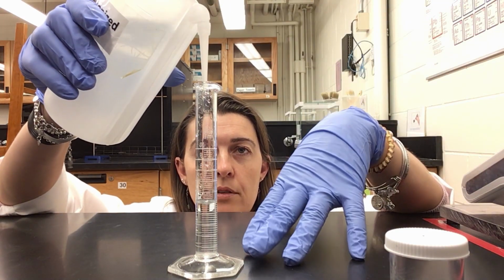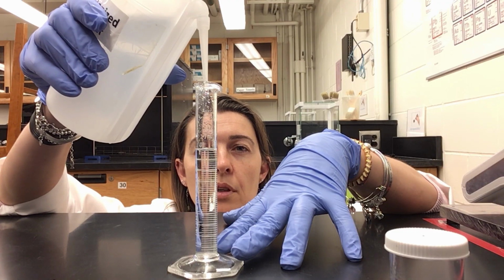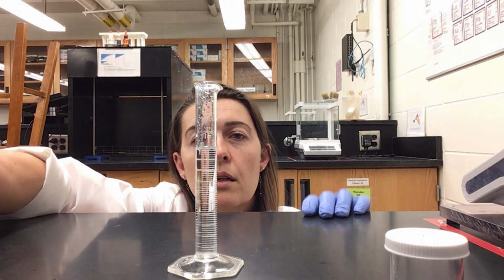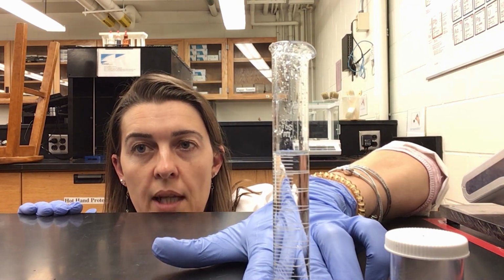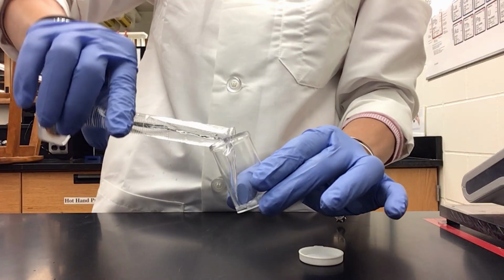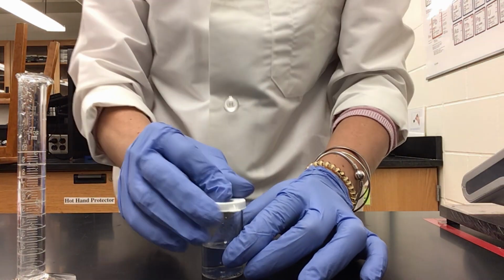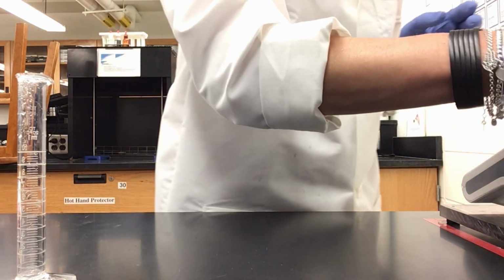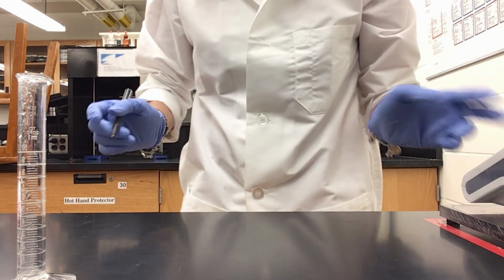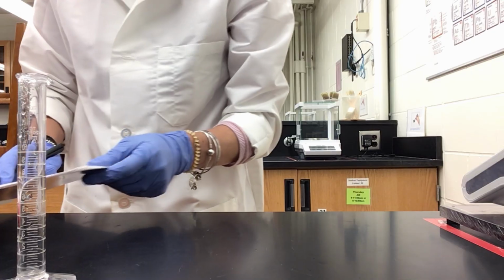So I can go a little faster now. And I need to make sure that the meniscus is right at 10. Oops. Okay, so can you see this? The meniscus is right at 10. So now I am gonna take my dried vial and transfer everything inside it, shake it really well, cap the vial, and weight it again. So this time, wow, I have been quite precise. So this time the weight is 16.659, and I am going to write this down on a piece of paper.